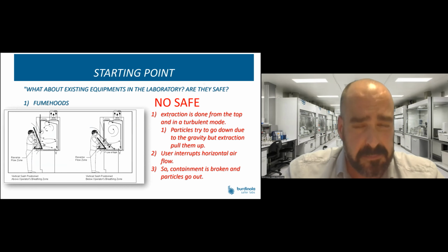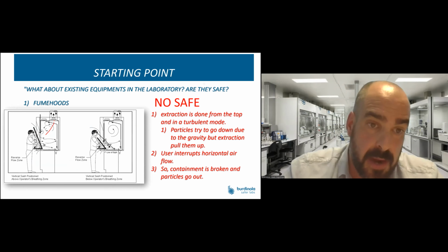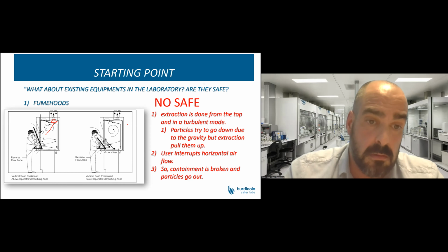Here we have a difference, because in these cases, the extraction is done by the upper part of the cabinet. So particles, nanoparticles, or nanomaterials, in this case, try to go down by gravity, and they remain floating in this zone.